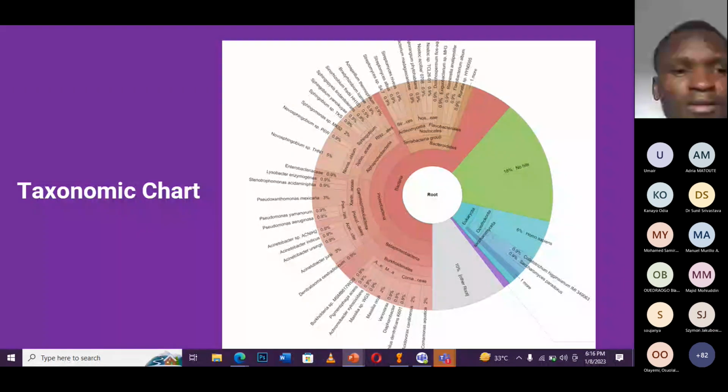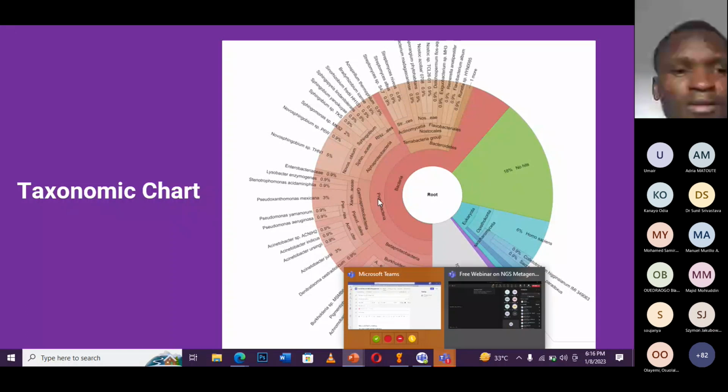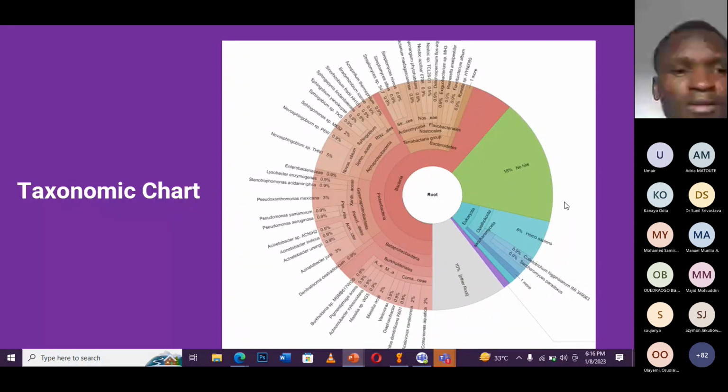If we want to get only one bacterial genome population, what can we do, whole genome or metagenome? Only one bacterial population? You have to do whole genome. And after the whole genome, we further learn about the taxonomic classification.